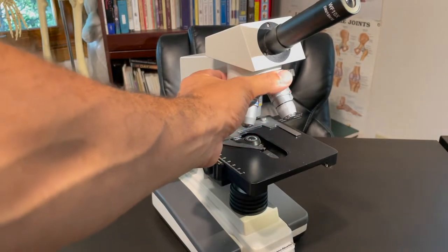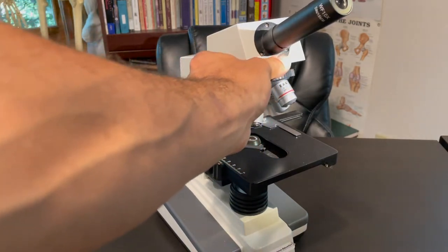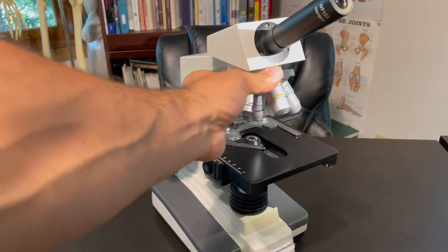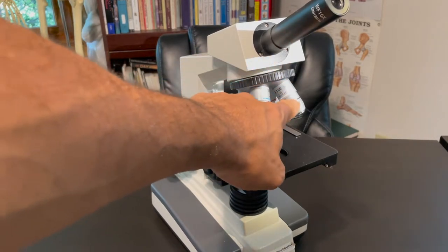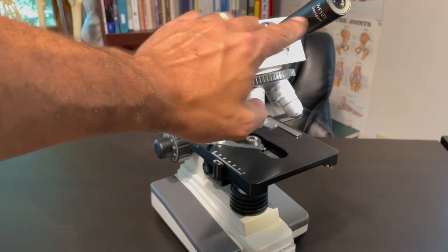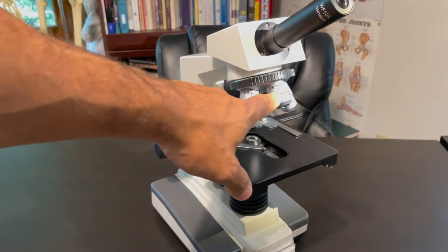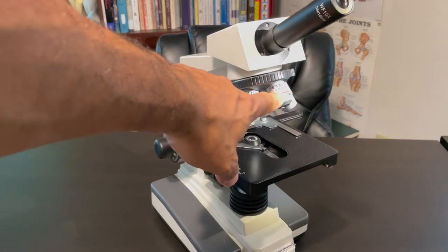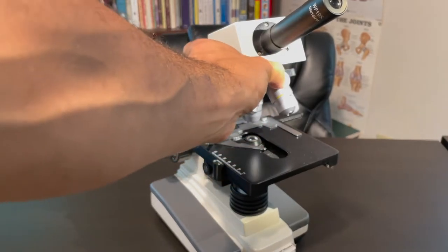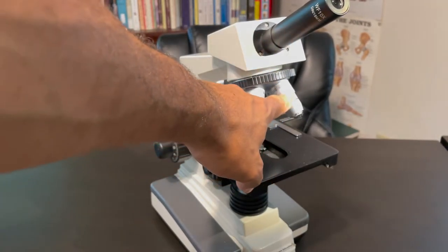We also have the nose, which is what I'm touching here. This is the nose that spins these objective lenses here. You have a red objective lens, yellow, blue, white, or sometimes black, and these have different magnifications. Just like this ocular lens has a magnification of 10x, these also have different magnifications. For example, the red is always 4x and the yellow is always 10x, the blue is always 40x, and the white or black is 100x.